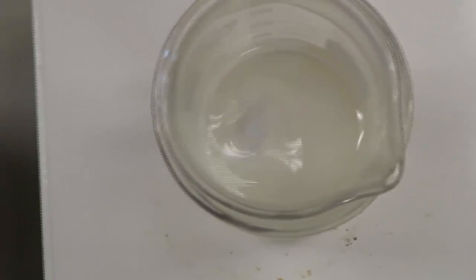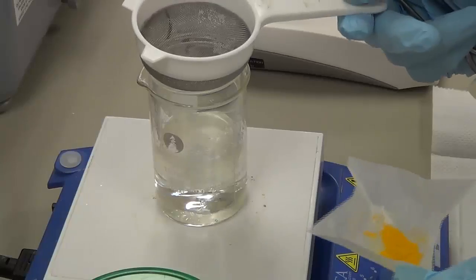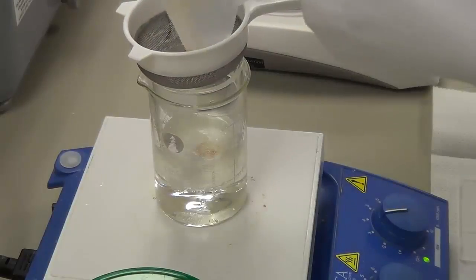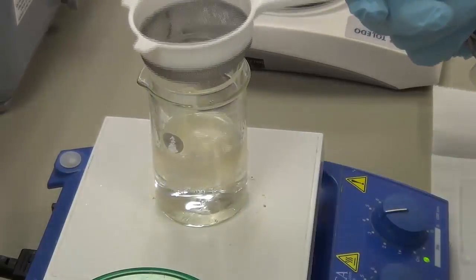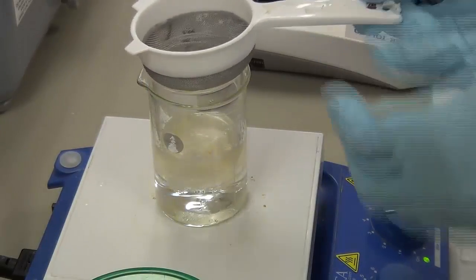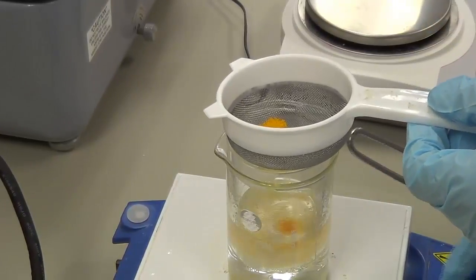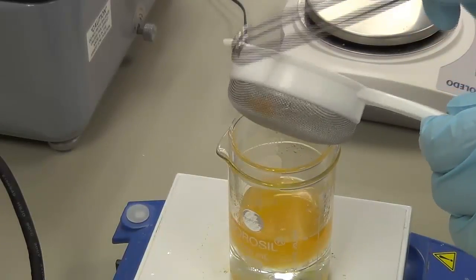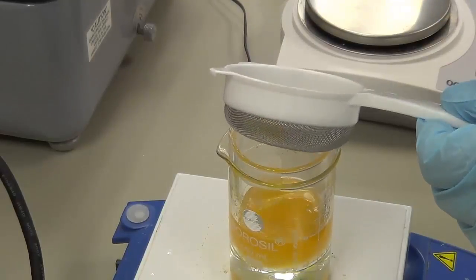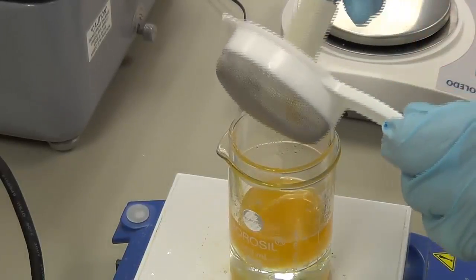This is the base which I started melting, so it's already melted. I'm going to sieve the drug directly into this beaker. Watch this. I'm going to place the drug, and the advantage of using the weighing paper rather than a weighing boat is that you'll have better control. I'm going to tap it gently so that the drug is not going to spill outside the beaker. If excessive drug is left over, I'm going to use the spatula gently and let it pass through the sieve.